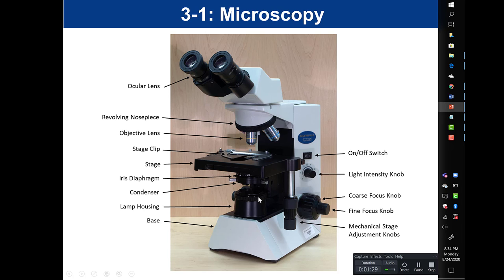The lamp is down here — this is the light source. The light comes up, and the condenser gathers and focuses the light onto the specimen. On the condenser is a little lever called the iris diaphragm, which can open and close to control the amount of light that exits the condenser.